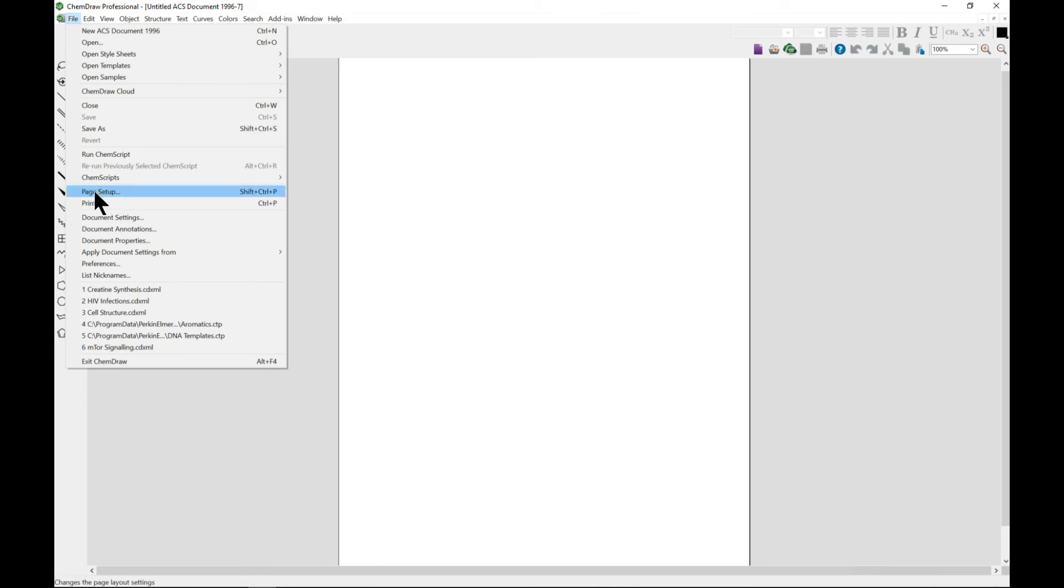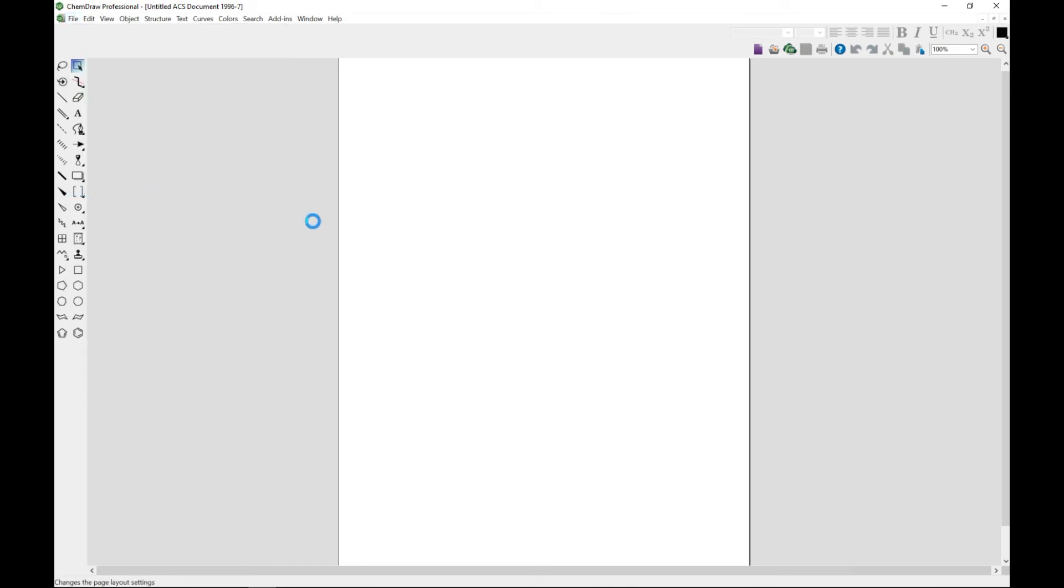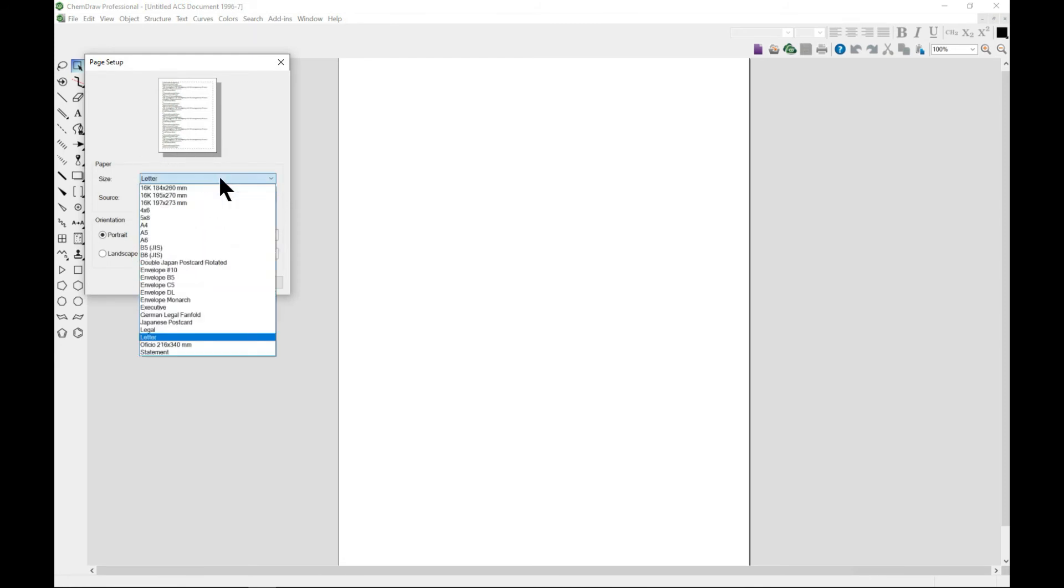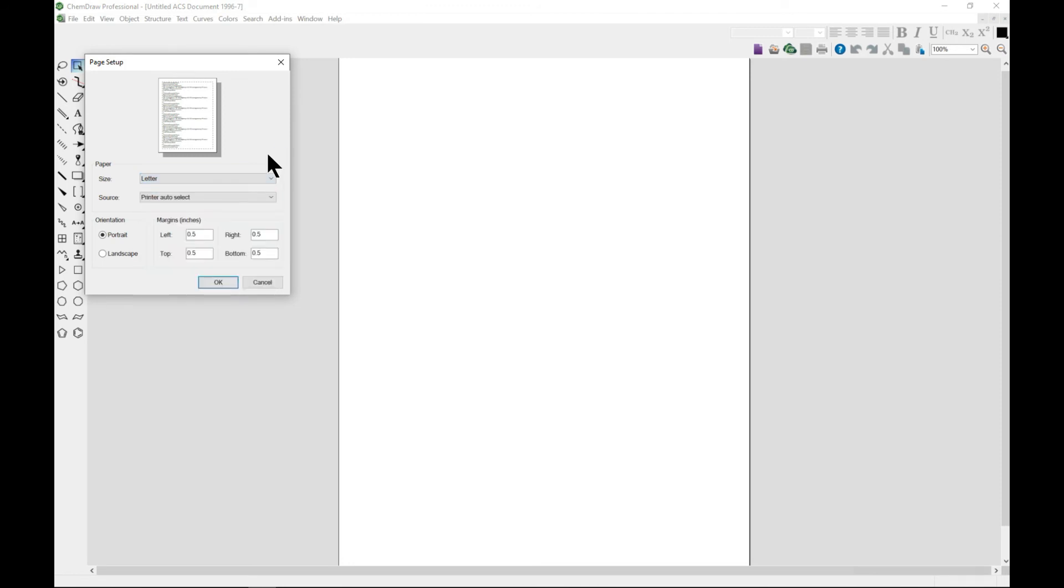The other thing is to go to Page Setup. From the page setup you can also set your page. You can make it an A4, whichever paper size, because maybe you want to print.